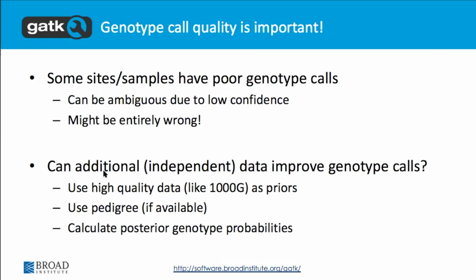In some cases, the genotype we assigned is actually wrong. And we're able, to some extent, to refine that, correct that post hoc. We're going to have to make some assumptions, but I'll show you the rationale behind those assumptions. And so we're going to use population data, for example, data that we have about the frequency of certain alleles in certain populations.